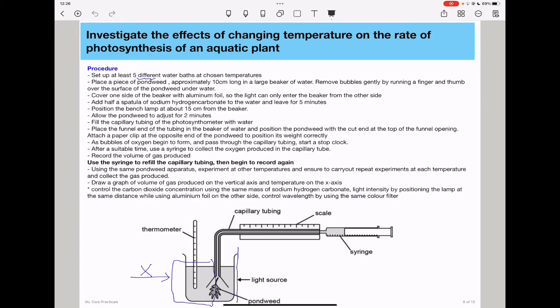Use a syringe to refill the capillary tubing and then begin to record again. Using the same pondweed apparatus, experiment at other temperatures and ensure to carry out repeat experiments at each temperature and collect the gas produced. Draw a graph of volume of gas produced on the vertical axis and temperature on the x-axis.